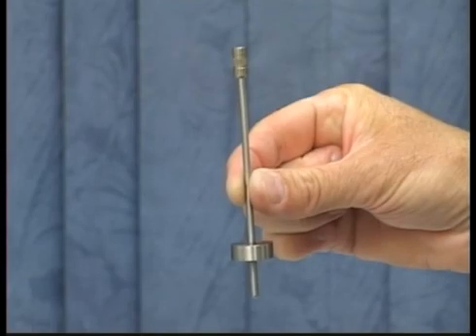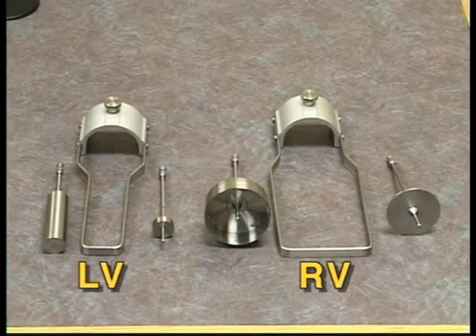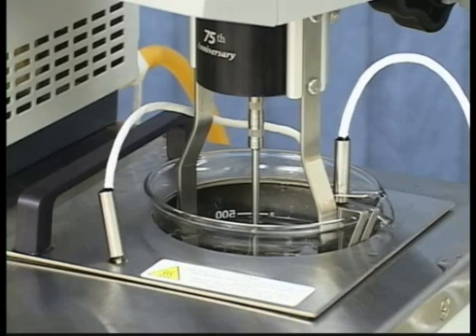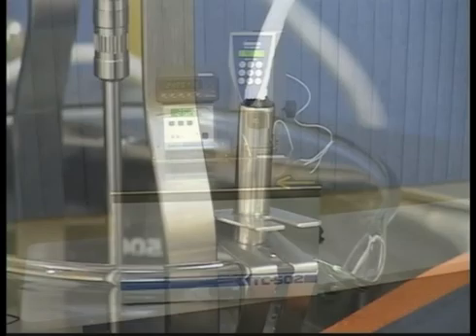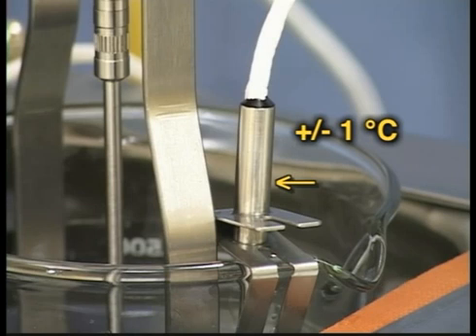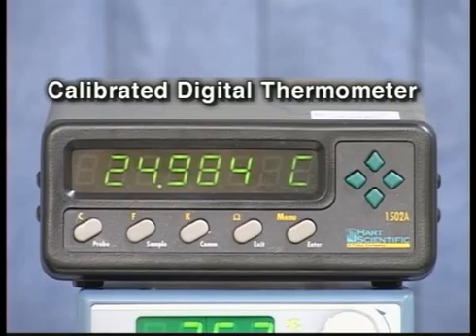Select the spindle you will be using to run the calibration check. Remember, with an LV or RV number one or number two spindle, you will need to use the guard leg to get accurate readings. For proper temperature equilibration, the fluid, spindle, and guard leg, if appropriate, all need to be equilibrated at 25 degrees Celsius. The viscosity standards are very sensitive to temperature. The temperature probe on the Brookfield viscometer is accurate to plus or minus one degree centigrade. To ensure proper temperature equilibration and accuracy for the viscosity standard, use a calibrated thermometer with higher accuracy.